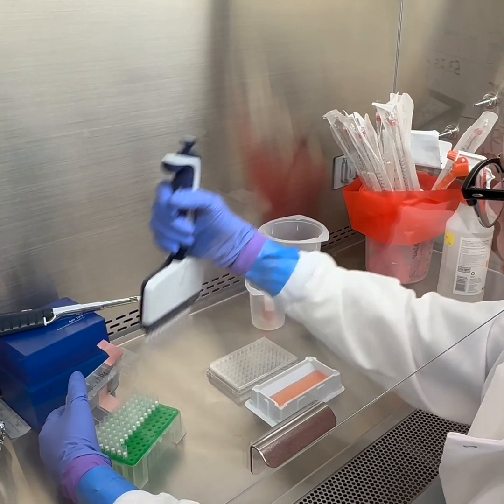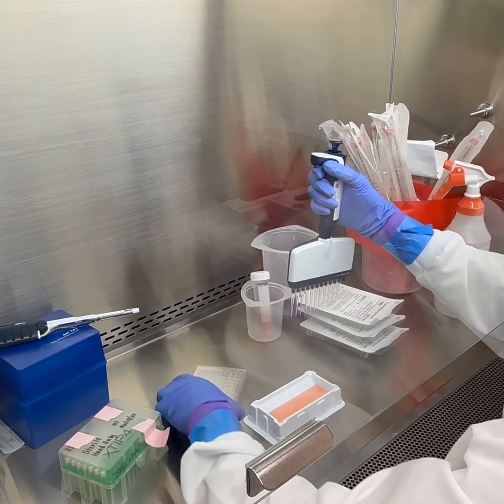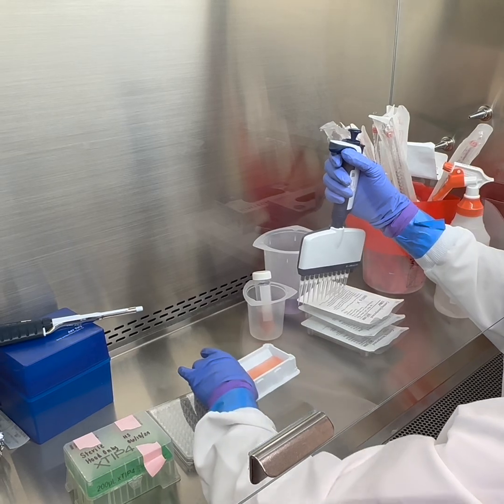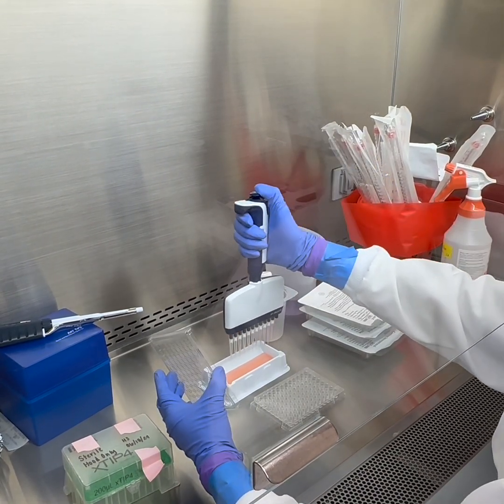So lanes 1 through 10 are going to be your testing lanes. Lane 11 is going to be your positive control. Lane 12 is going to be your negative control. So we're not going to have anything in lane 12.